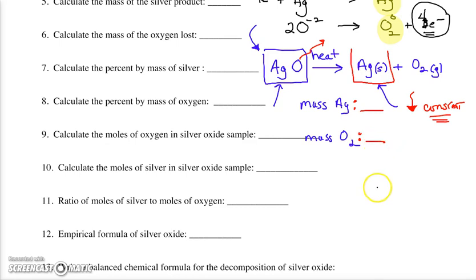So if you didn't follow that, I'm going to have the mass of the silver that's remaining after I've heated several times to check. And then I'm going to subtract out the crucible's weight. We should know that. So when we started our lab procedure, the first thing we did was take our crucible and its cover, and we heated it gently. Why did we heat it gently? We heated it gently so that we can drive off all the impurities or any water.